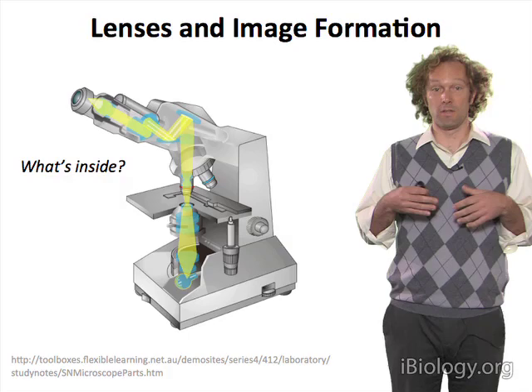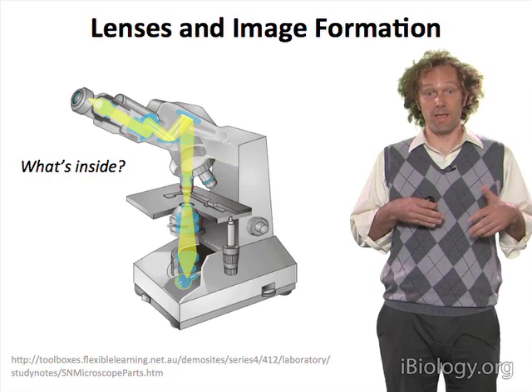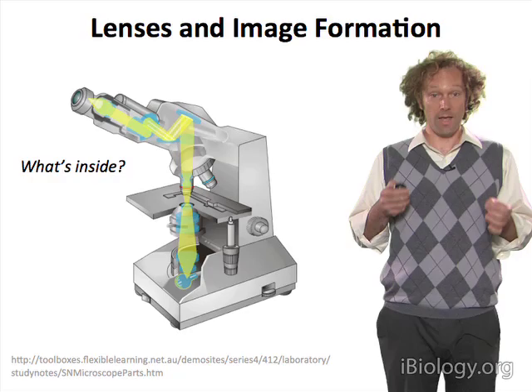So in order to understand what's inside of a microscope, to understand how to use a microscope to the best of its abilities, and to figure out how to innovate to produce new imaging capabilities, one needs to know the fundamentals of light, lenses, and image formation.